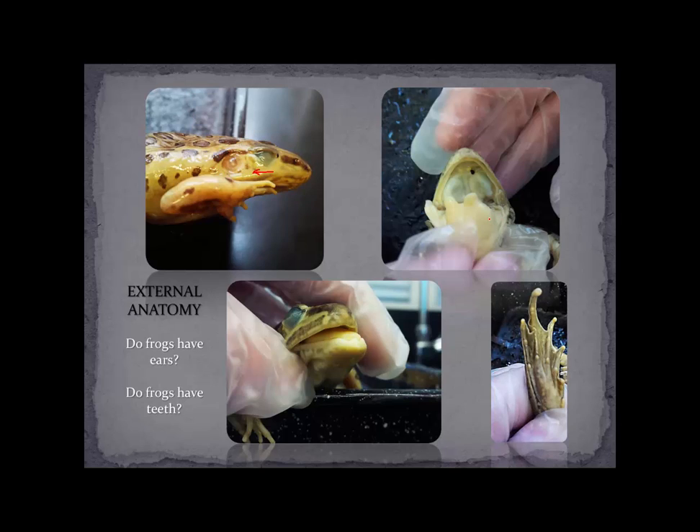The other thing you'll want to do before you actually get into cutting the frog open and dissecting it is have a definite look at the external anatomy, including the eye and the tympanum, and look at the external nares — the nostrils bringing air into the mouth. You can see right here the location of those nares as they come into the mouth region. An interesting thing about the tongue of a frog is that it attaches to the front of the mouth, so that's how it can project the tongue out really far to capture insects.